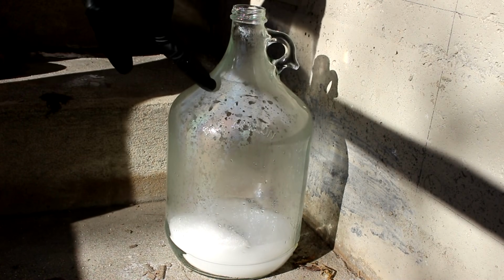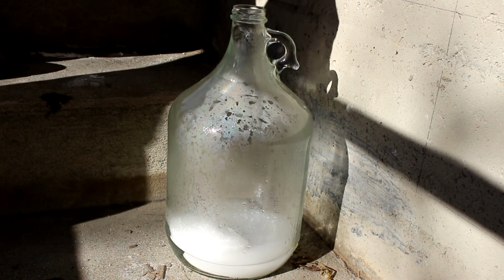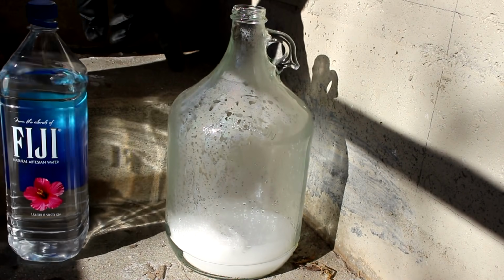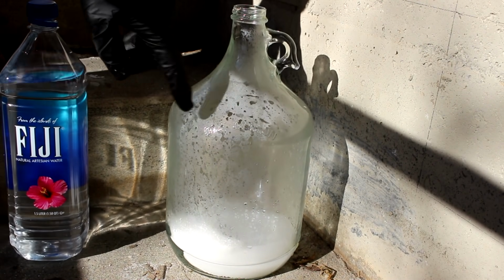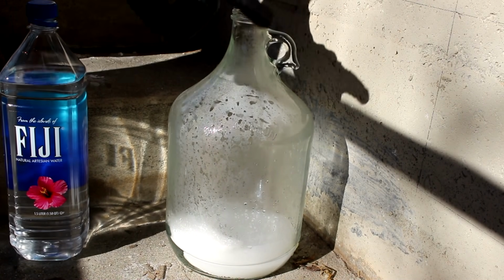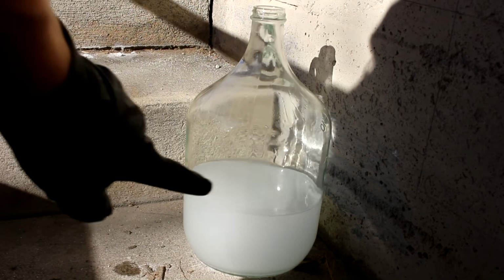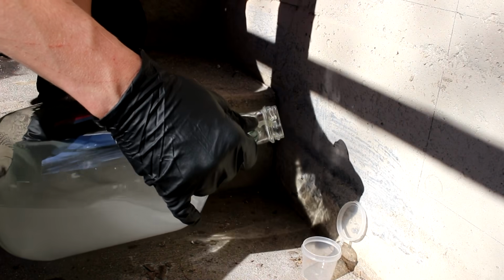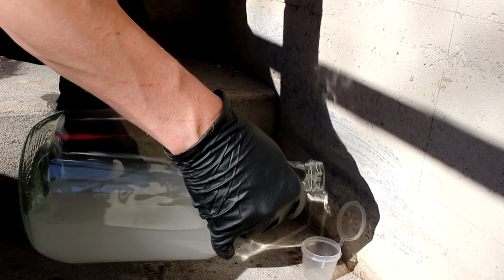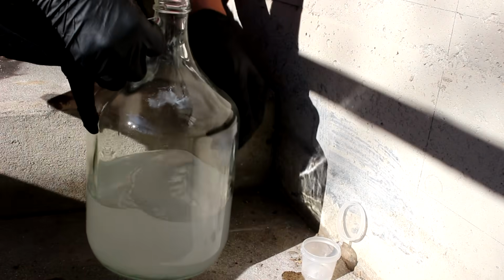So it has just occurred to me that the sodium hydroxide contains hydrogen. So I'm contaminating my Fiji water with hydrogen from the sodium hydroxide, which means I'm going to have to take a sample of this that's mixed up. And if I ever get the chance, I need to run an isotopic analysis on this. That's 1 pound of sodium hydroxide and 1.5 liters of Fiji water. Now that this has come to a chemical equilibrium, I'm going to pour off a little bit into the sample cup. That way I've got it for later reference.